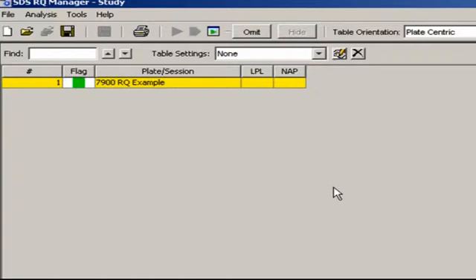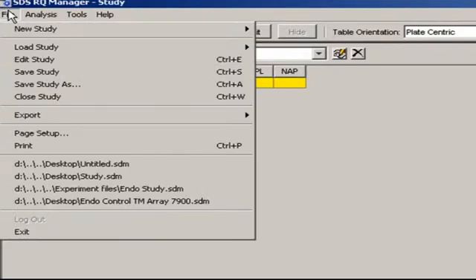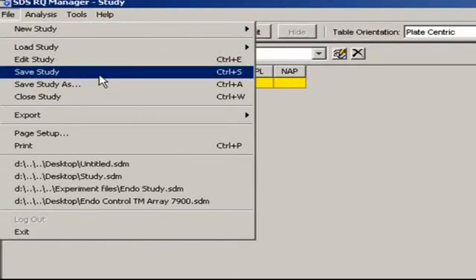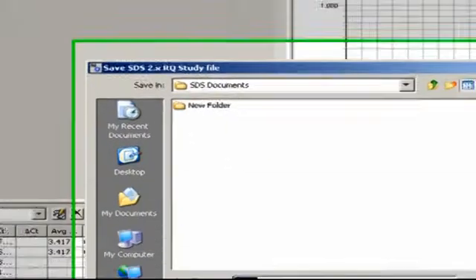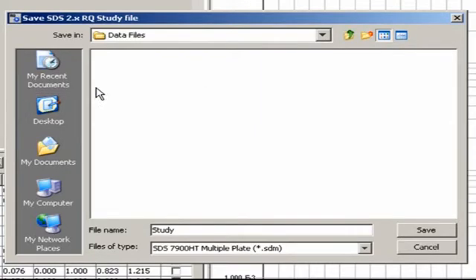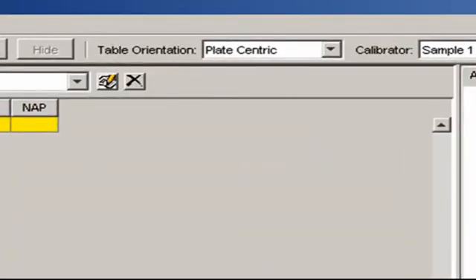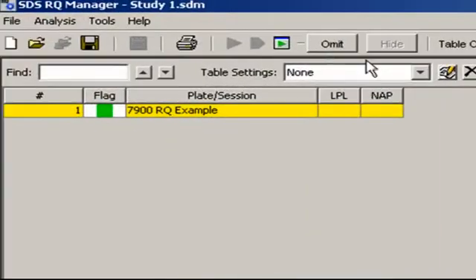First, though, let's save the study as a .sdm file by going to File, Save Study, choosing a location on the hard drive, giving it a name, and clicking Save. Next, and this is very important, go under the pull-down menu for Table Orientation and be sure Plate Centric is chosen. At this point, we can export.